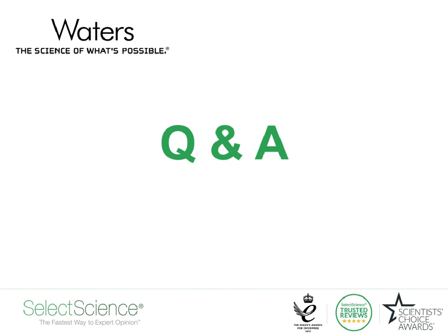All right. Our next question is for Malcolm. When you compared wound growth tissue to dermis, epidermis, do you know what was causing the signals that allowed you to determine their identity?